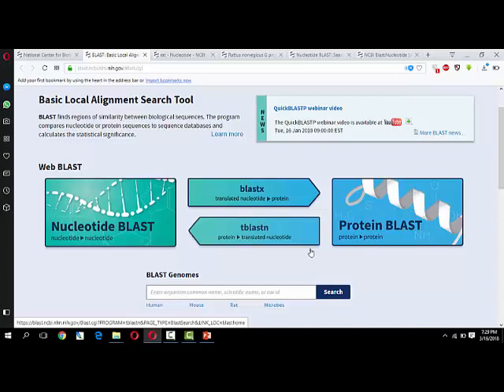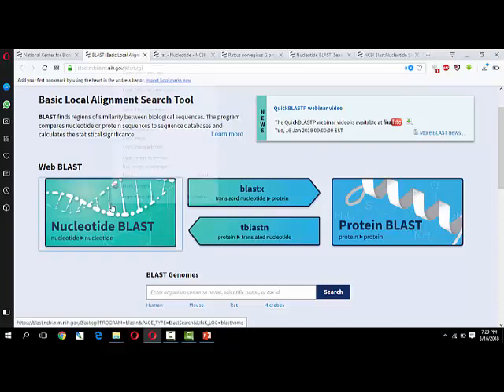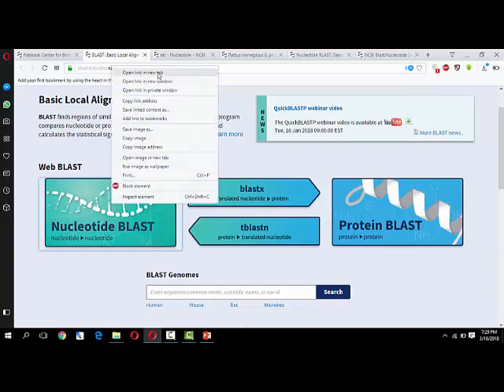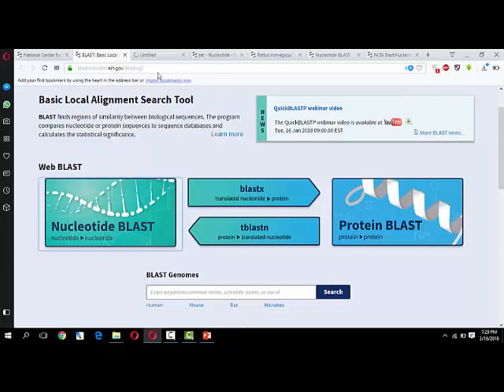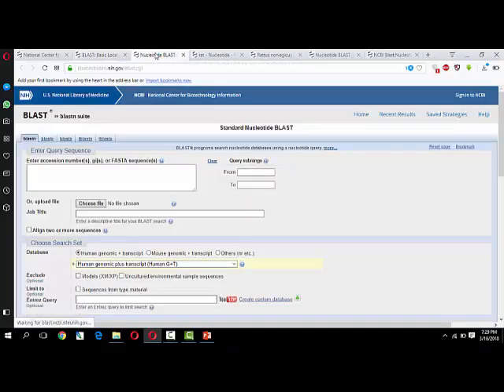This is the home page of BLAST. If you are going to do nucleotide BLAST, you have to click on it. Once you open nucleotide BLAST, its home page will be opened.